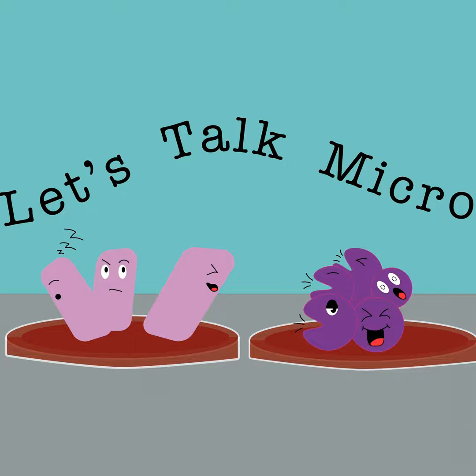And I think it really did add to what I can do in person. One thing I also did, a lot of the simulations I used and a lot of the things I had students do when we were remote, I now assign as a pre-lab. For instance, when we were remote, I would have students literally set up a bench like they were in a micro lab and show me how they would do a quadrant streak.